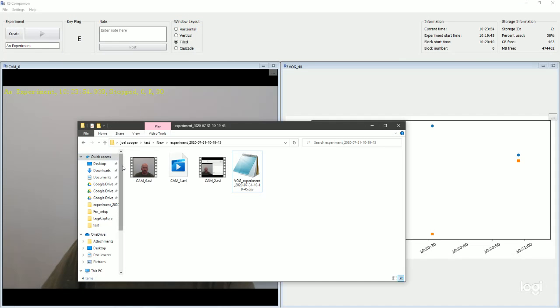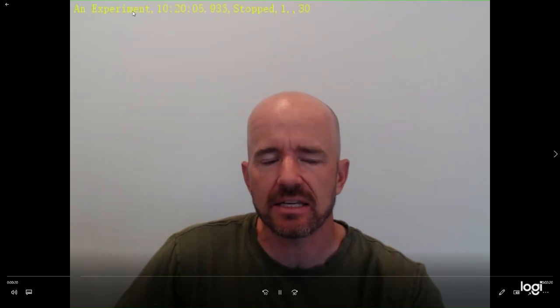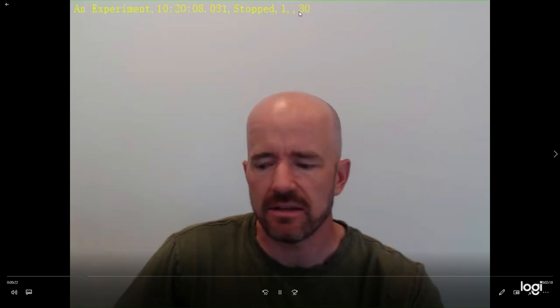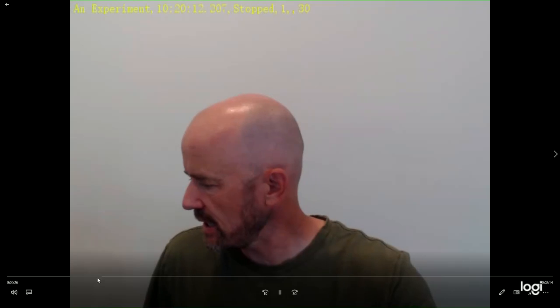Also, we get the video, so just so you can see, here's video of me describing this study. At some point, I enter an experiment, and that's flagged up here. The key flag doesn't show up until a little bit later, but eventually we'll see that pop up here when I demonstrate that. Show you the goggles, all this showed up, and there's the key flag.